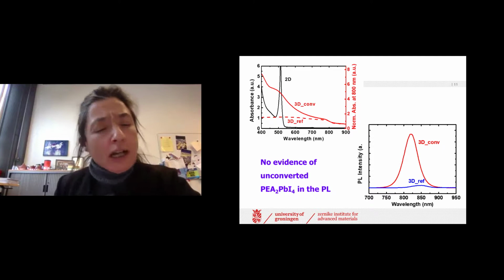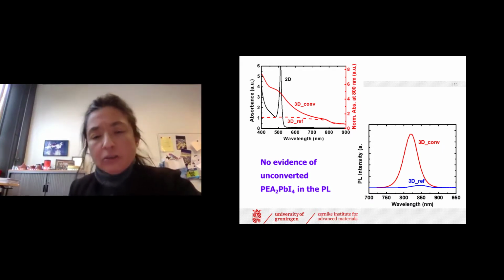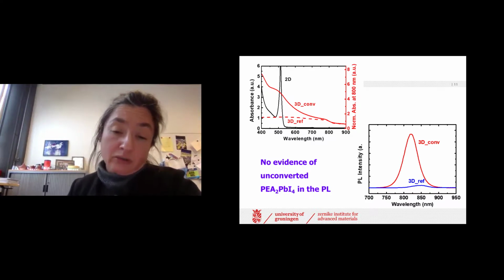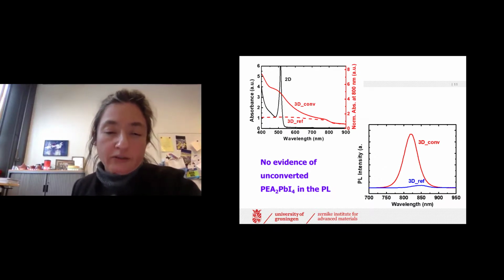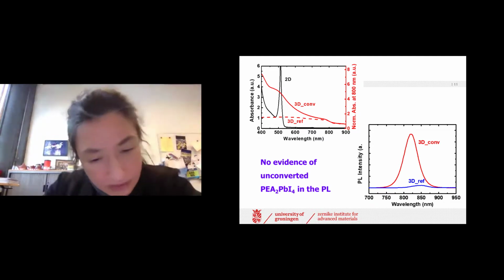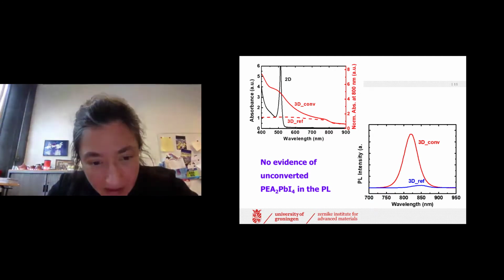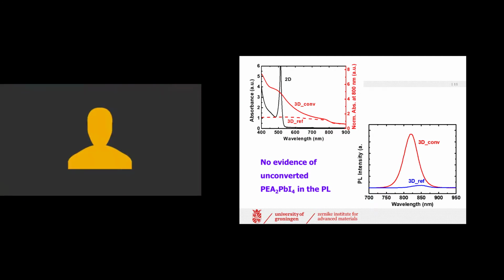Okay. I don't have the measurement here, but if I remember correctly, the lifetime of the converted one is much longer, in agreement also with what we see from the quantum yield of the sample in general. It becomes much more bright. The second question, I don't remember anymore. About the surface passivation, how is the film morphology evolving?